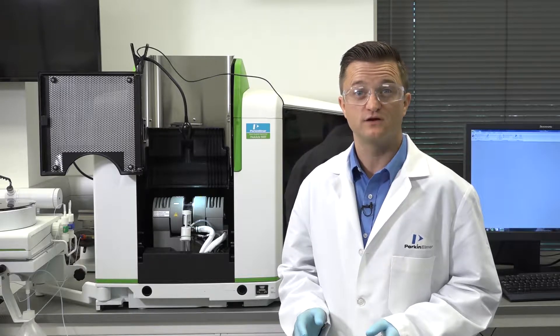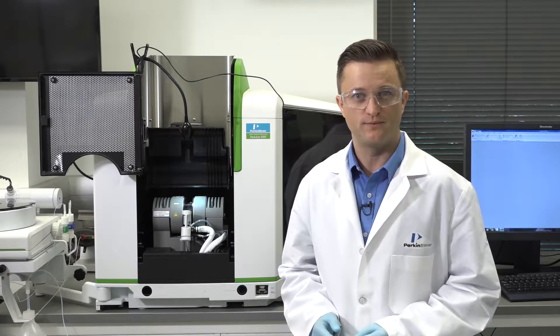Note that the graphite furnace can generate very high temperatures. Do not touch any parts of the furnace, especially the graphite components, until they have cooled to room temperature. Remember never to touch the graphite parts with your bare hands.